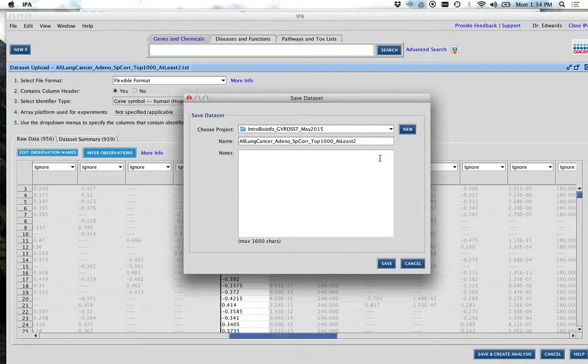I have a quick question. Yes. When we're analyzing this, we have different platforms, like Illumina. How do we account for that, because we went with gene symbol? Here's what I did: I imported all of our gene lists into IPA. I did a comparison analysis, and I'll show you that in just a minute. From that comparison analysis, it grouped everything based on similar genes, and it didn't care whether it was Affymetrix or Illumina. From that list, I turned the IDs into ones, and then I could add how many times that gene was in each list.